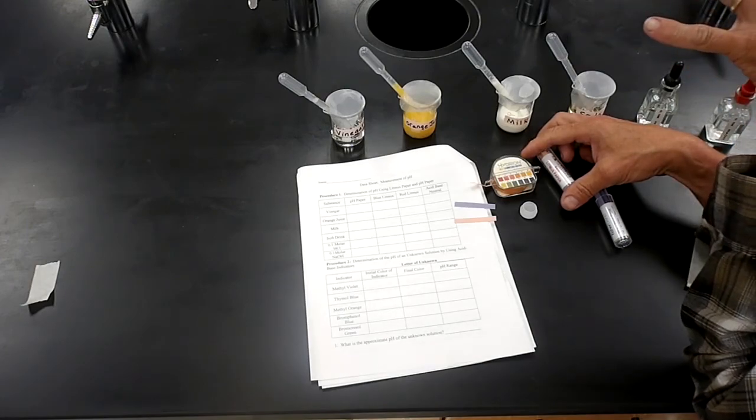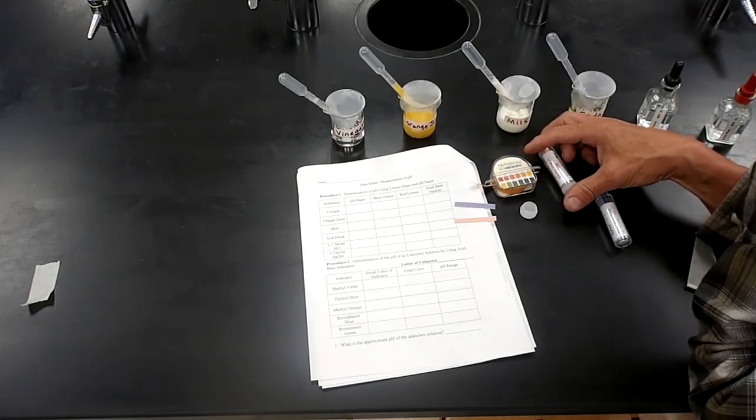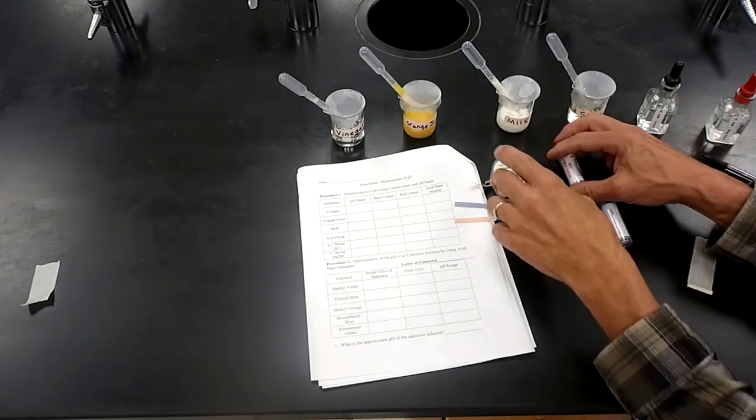Doesn't tell you the pH. If it's an acid, it could be anything below 7. You have no idea what. So it's pretty crude. Just tells you you've got an acidic or basic solution.